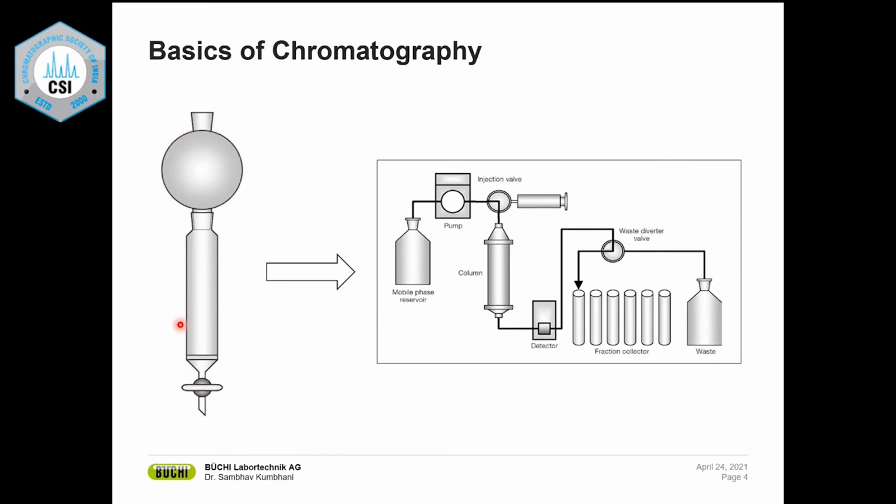You name it: liquid chromatography, LC, GC, affinity chromatography or size exclusion chromatography. There are many, many names to give, but the principle remains more or less the same. There is a stationary phase, there's a mobile phase, there's a sample. The sample interacts with the mobile phase and stationary phase, gets separated based on its properties, and then you elute one separated molecule after another and collect or analyze them, whatever you do. So the theory doesn't change more or less between different chromatography techniques, but the instrumentation, or the sophistication of doing the thing, has come a long way since Tswett's time.